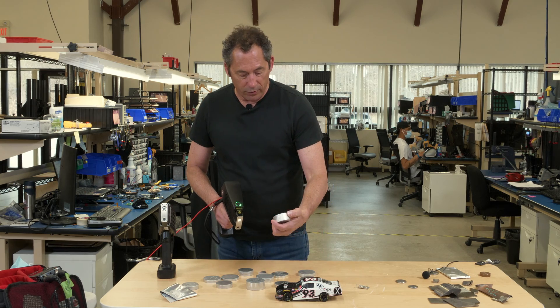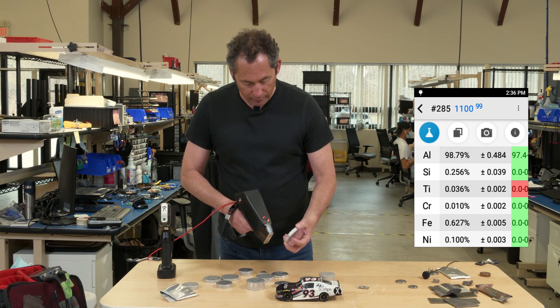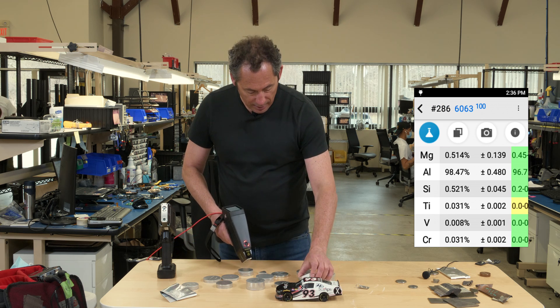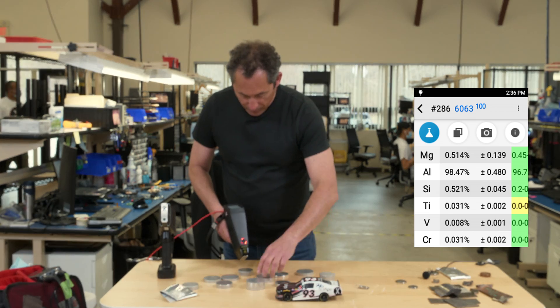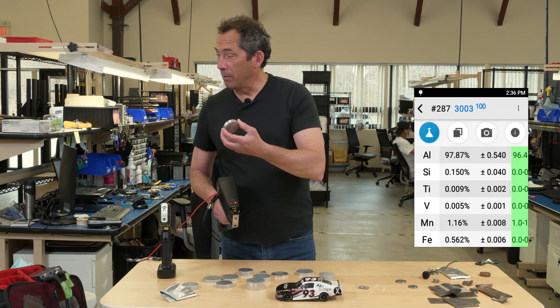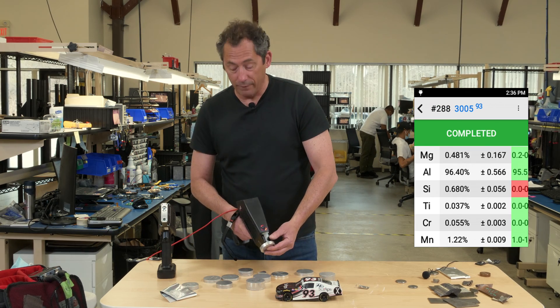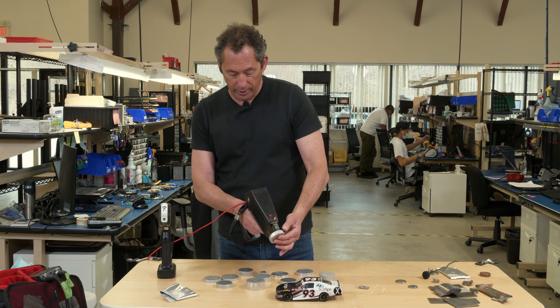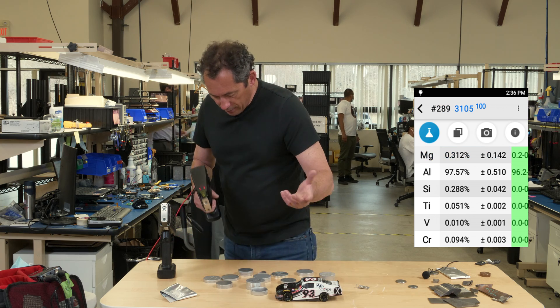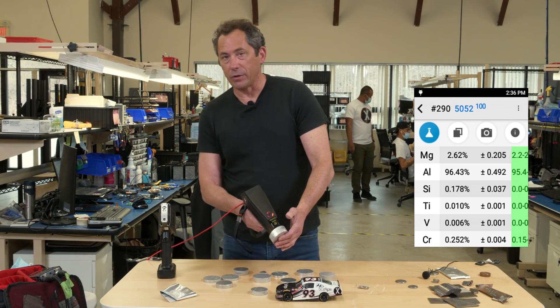Let's take a few shots. First the easy stuff: 1100 — about one second, 1100. 6063 — about one second, 6063, perfect match. Here's our 3003 — one second, 3003. Here's that tricky 3005 that took a little longer with the 505 — not with the X-550. Just in a couple of seconds, 3005. It's really fast on all your aluminum grades. Here's a 3105 — you don't see that a lot, but there you go. And here's a 5052 — like one second, almost 2.5% magnesium.